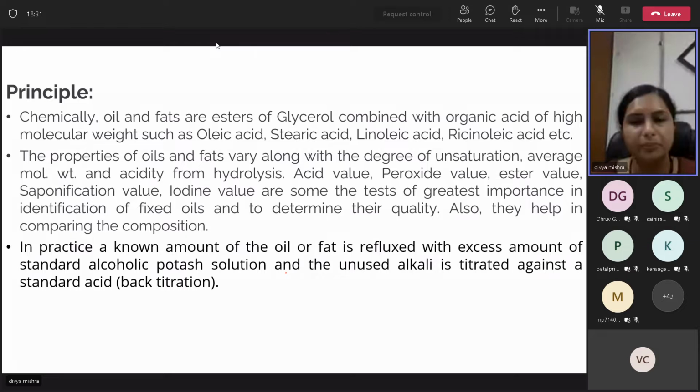तो क्या होगा जब हम इसको मिक्स करेंगे, रिफ्लेक्स करेंगे ज्यादा देर तक, तो क्या होगा? सोप आपका बनना चाहिए ना। अब आपका जो KOH है उसमें से पोटेशियम सॉल्ट जो है आपका फैटी एसिड में जो ग्रुप है अल्काइल, उसके साथ मिलकर के लॉन्ग अल्काइल चेन बनाएगा ऑफ पोटेशियम. So that is why we call this process as formation of soap, that is saponification.